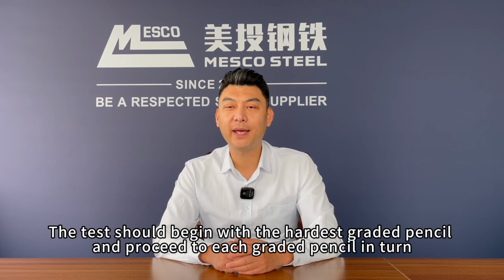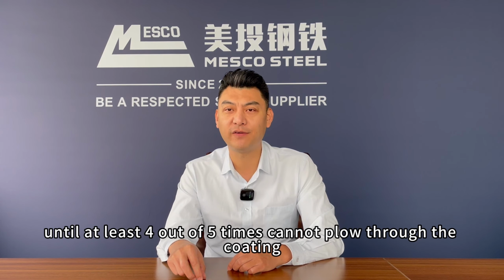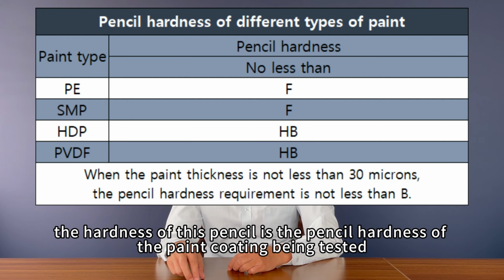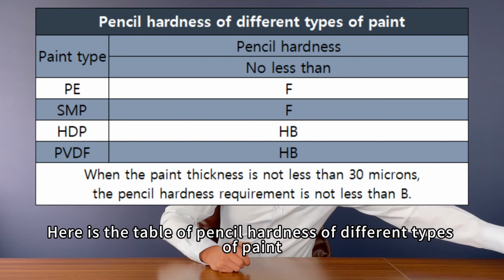The test should begin with the hardest graded pencil and proceed to each graded pencil in turn. Each level of pencil is scratched 5 times until at least 4 out of 5 times cannot plow through the coating. The hardness of this pencil is the pencil hardness of the paint coating being tested. Here is the table of pencil hardness of different types of paint.